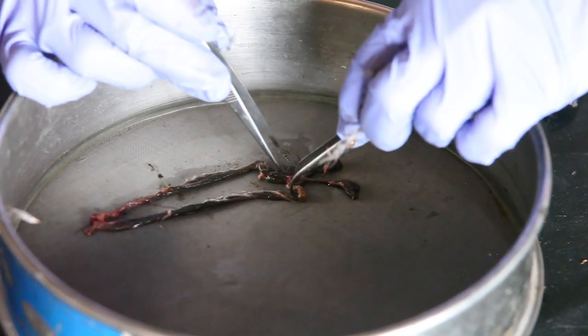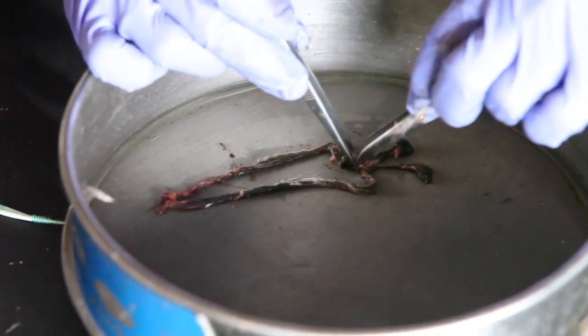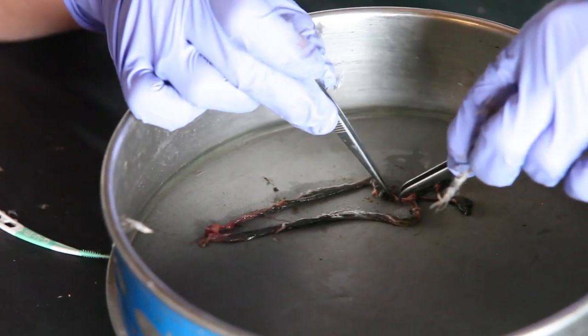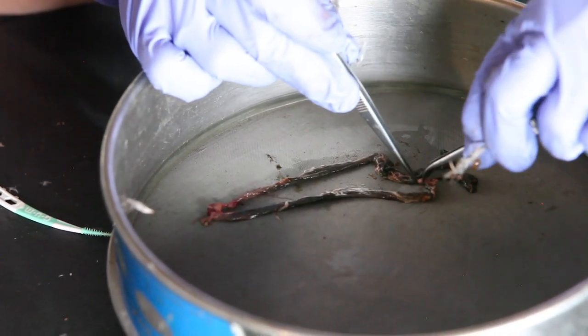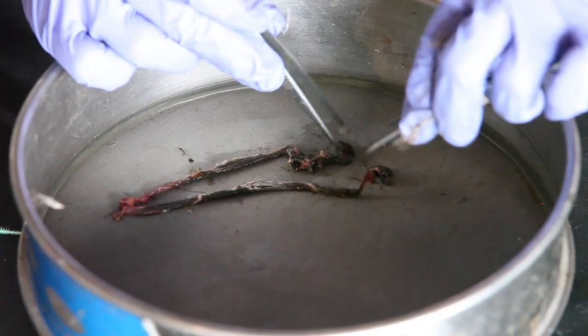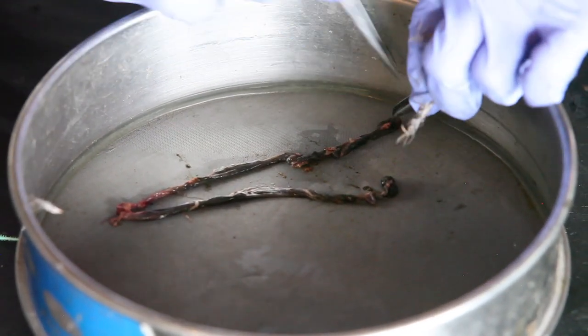Again, this is not a technique that you're going to do in the field at the end of the day's hunt. This is a laboratory technique that we're interested in, but should you be interested in cecal worms, this is the technique you'd use to analyze them for such.